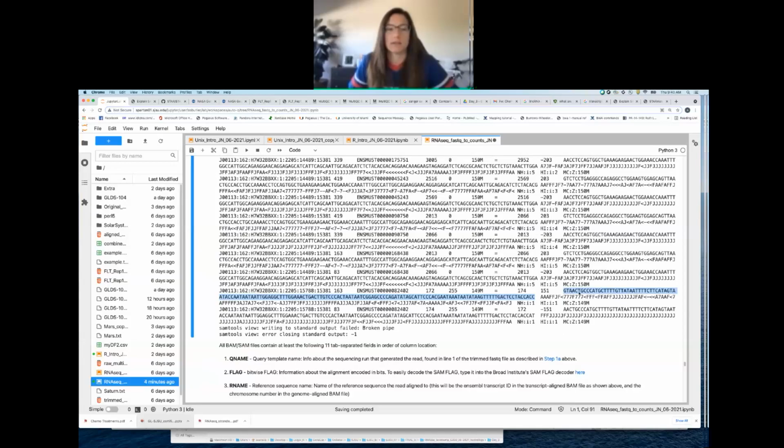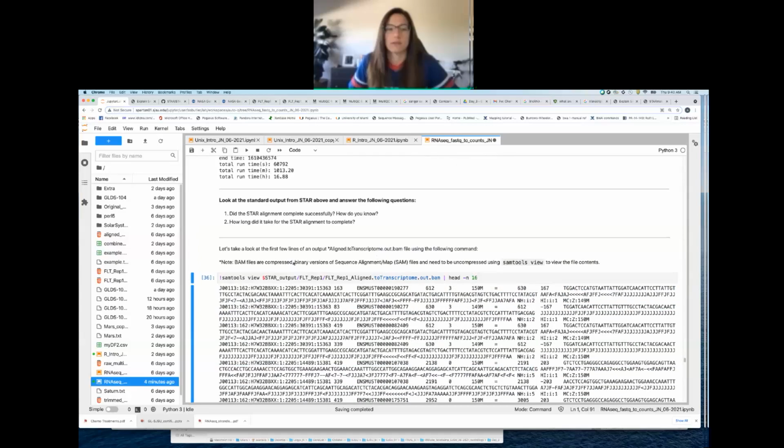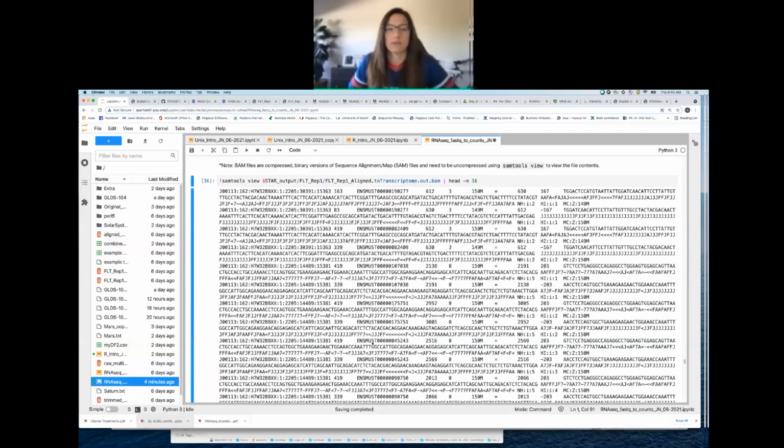So we can actually take a look at the gene that this read is aligned to by looking at the aligned to genome outBAM file, right? Because again, you're absolutely right. We can have multiple transcripts due to alternate splicing of our pre-mRNA to give us our mature mRNA, right? Which could be where this was derived from.